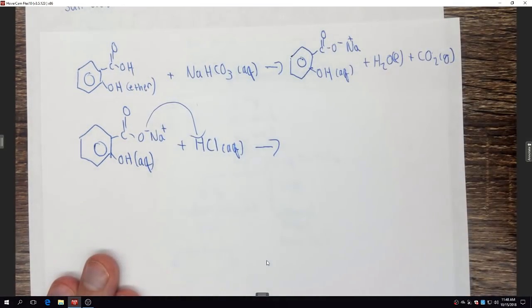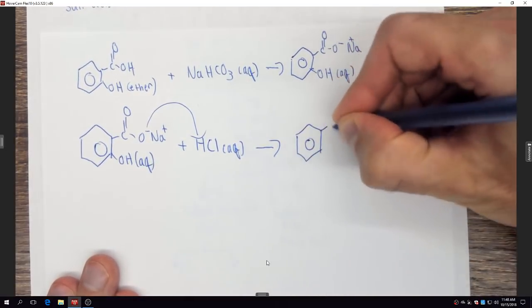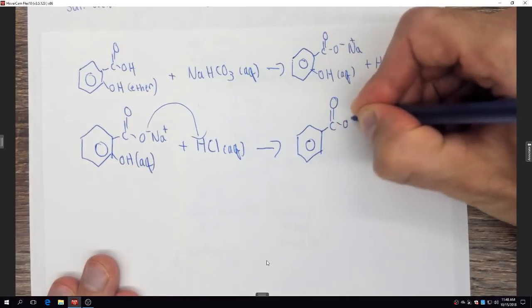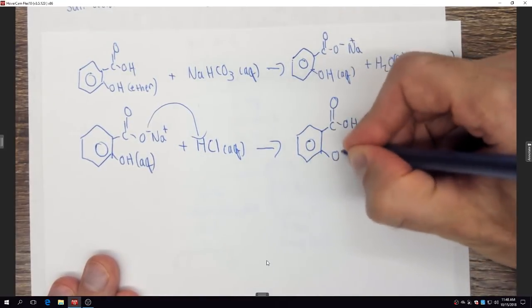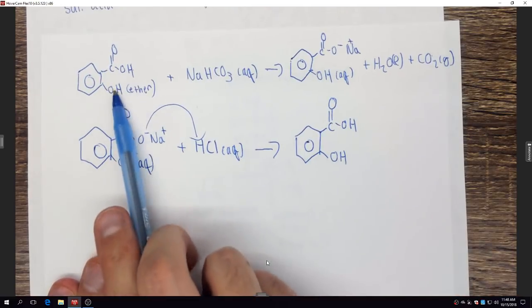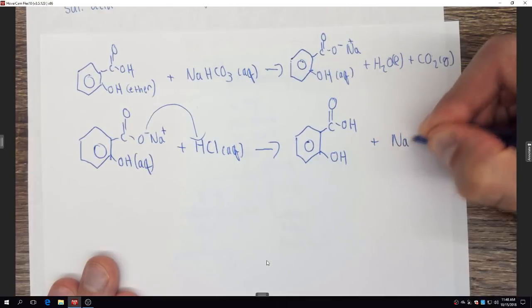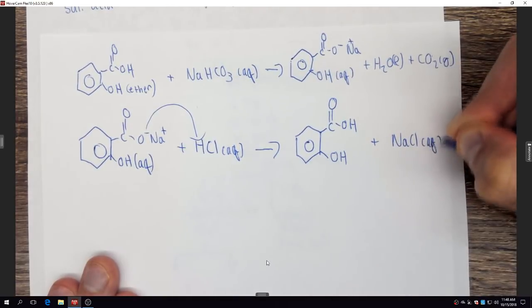Right? It wants to go on that O. So what do we get? We get our original salicylic acid back. Notice these are the same. And NaCl, which we all know is soluble in water.